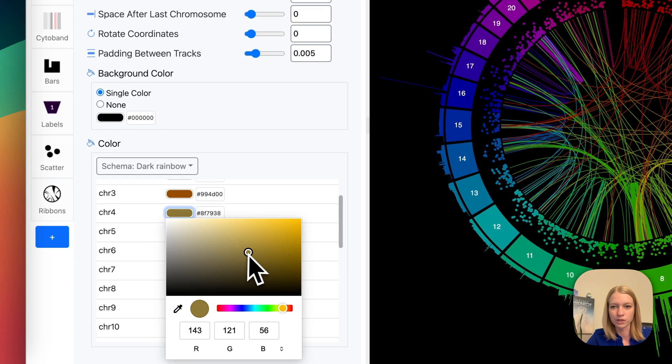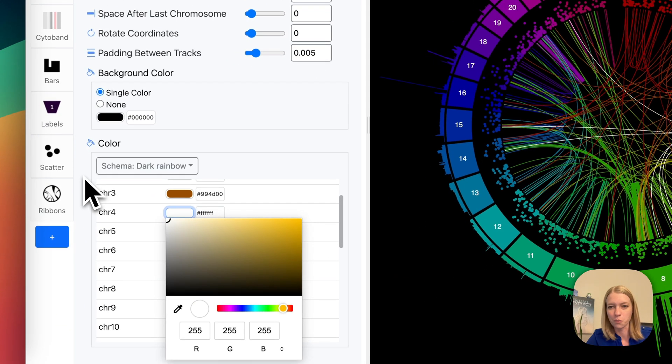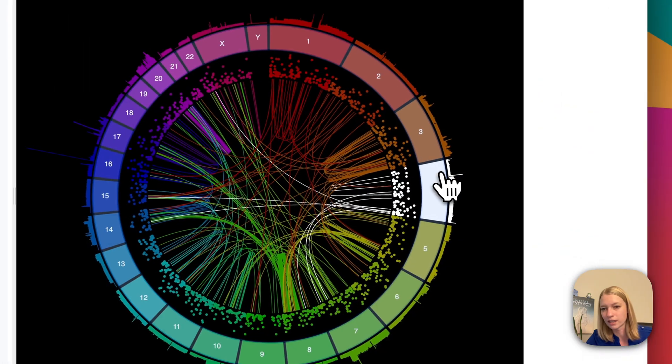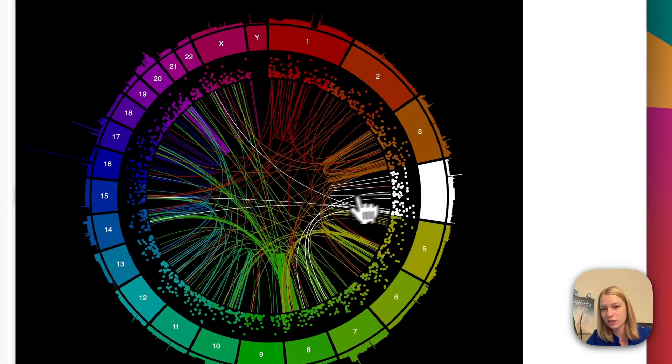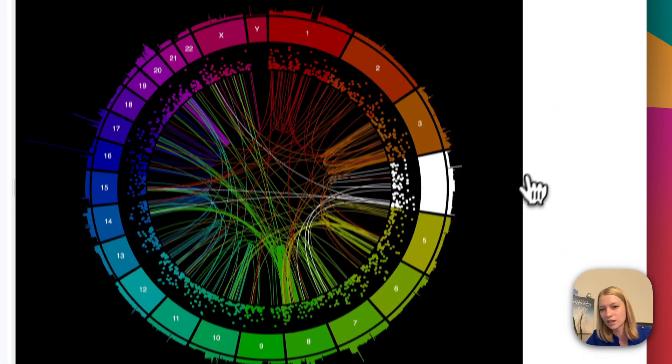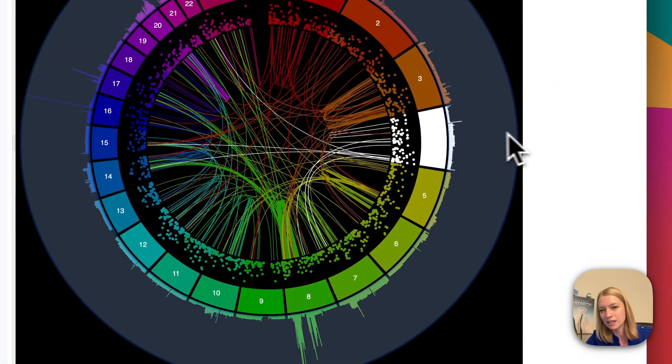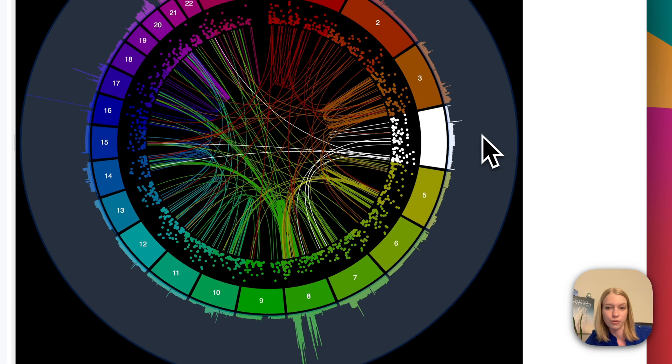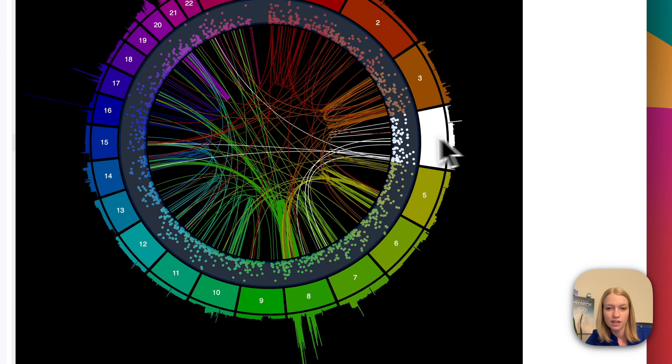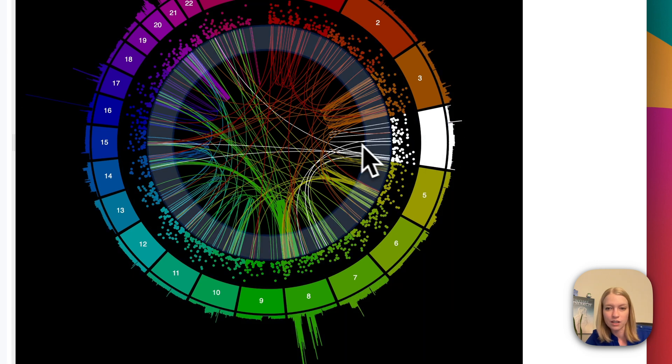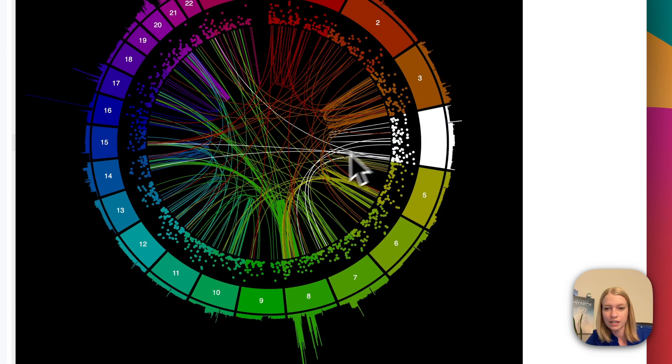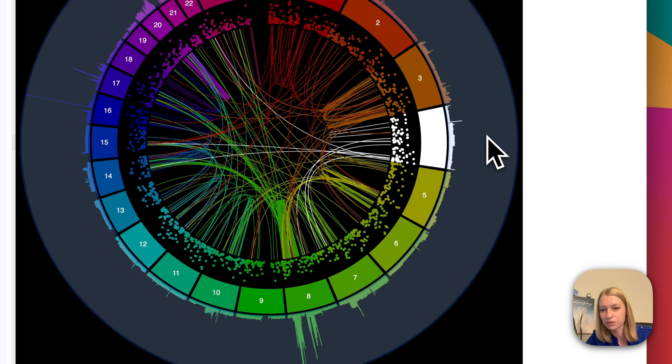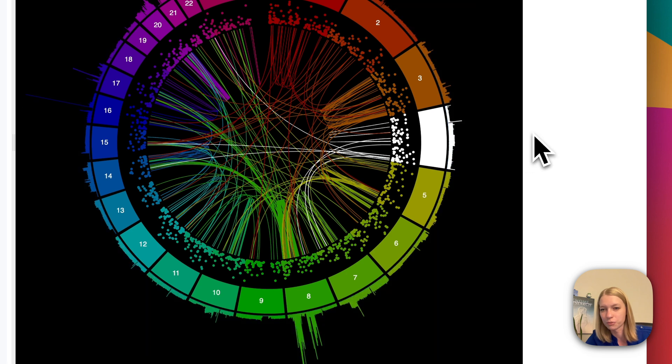Let's highlight one of these in white so you can see the sector contains data in potentially all of the tracks and can also have connections to other sectors. So here we've highlighted chromosome 4 in white.